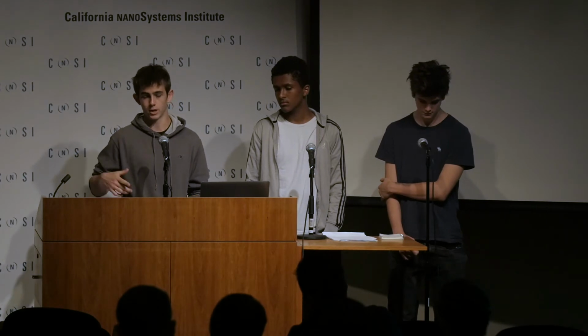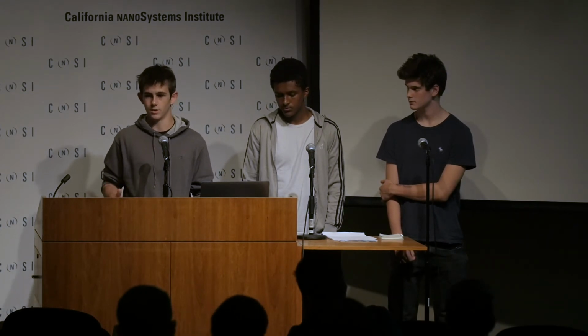What if I wanted to image, say, just 2 or 3 molecules or nanoparticles on a surface? Is there any technique I could implement to do so? Well, I assume you could use an electron microscope, because electrons have really tiny wavelengths. When they hit the monolayer, the interactions that come out of that can be imaged. The monolayer is really thin, only 1 molecule thick, but the electrons are extremely tiny, so they're able to interact with it and then produce an image.